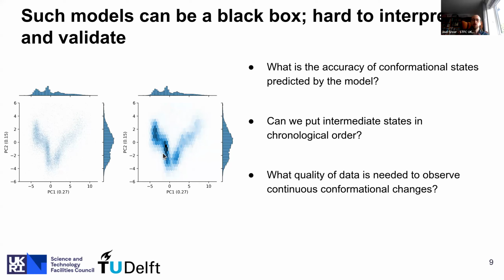Are the estimated volumes or deformation fields from the decoder networks representative of the actual atomic models of a macromolecule in a given image? Now, remember, there's no ground truth for the conformations of particles in experimental data sets. So it's impossible to know this just by looking at experimental data without any ground truth information. So what we'd like to do is to start investigating the accuracy of the predicted conformational states.